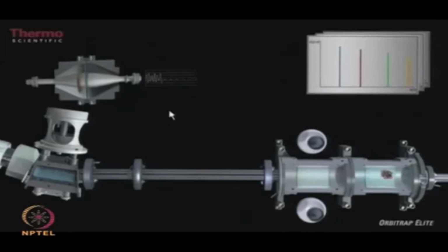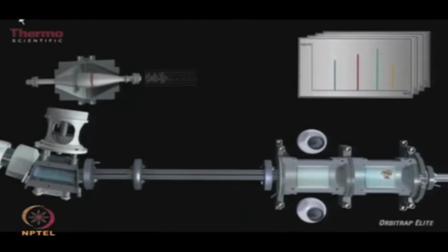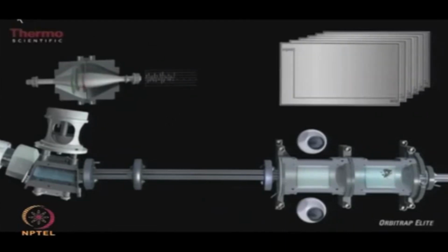If you want to work with the linear trap and the Orbitrap at the same time, you can run both at the same time. In the linear trap, the ions get stored and fragmented, and then are sent into the Orbitrap. So you can have the full scan MS as well as full scan MS/MS at the same time. In addition, you can also have a low resolution scan from the linear trap. So this is what you can obtain from the Orbitrap.